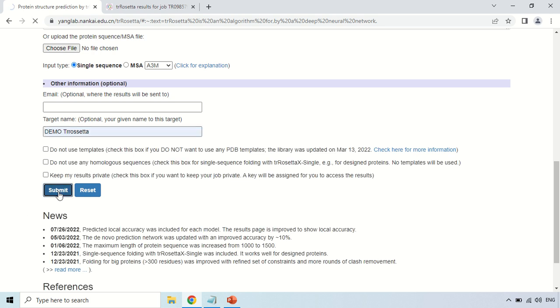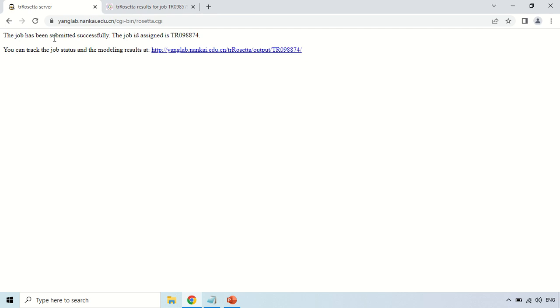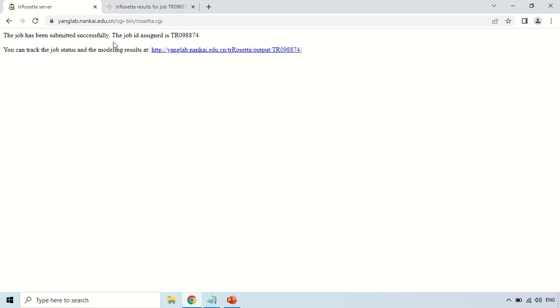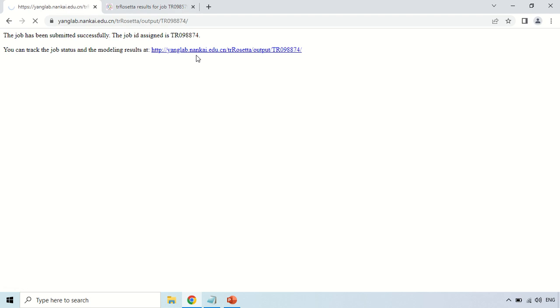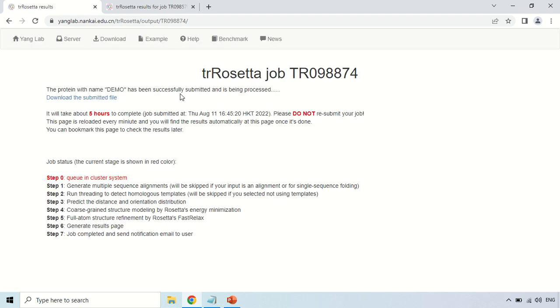As you click submit, the processing has started and your job has been submitted successfully. The sequence you provided is now under process. This is the job ID generated by the system, and this is the link where you can check your results. If you click this link, it will show you whether your results are ready or not. Right now it says it will take about five hours to complete the job — which is why I recommended providing your email. After five hours, when the result is generated, a link will be sent to your email. I have already downloaded the results of this particular sequence.